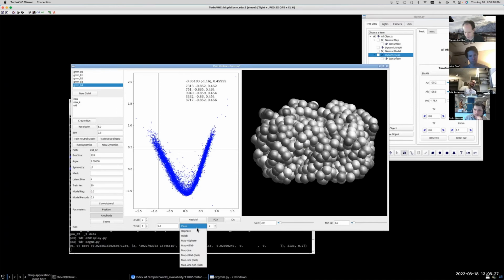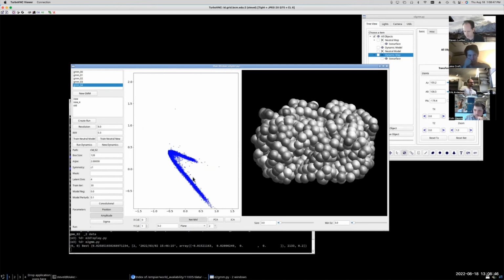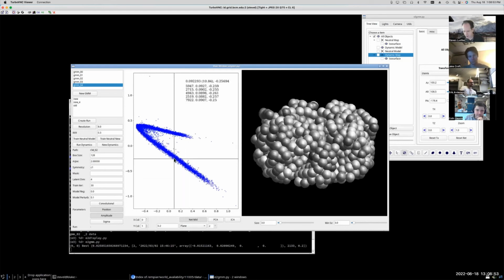I can go down here, and you can see there are different modes. I was using plane mode, which is basically saying that the point it's generating for those Gaussians is just a point in this abstract XY plane that we're looking at here. Now this is the result of the principal component analysis. If I go here, it's going to show me the 0-axis, 1-axis plane, a point at 0. So the other two axis positions are going to be 0.